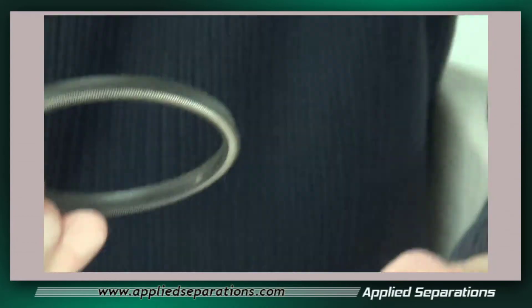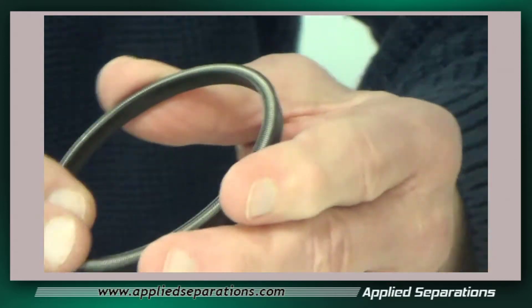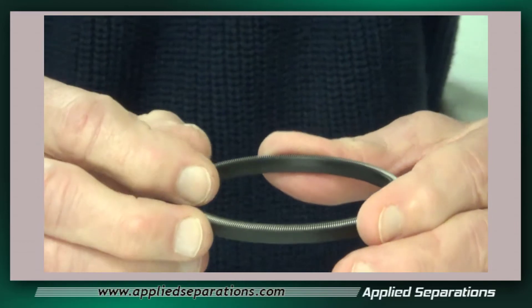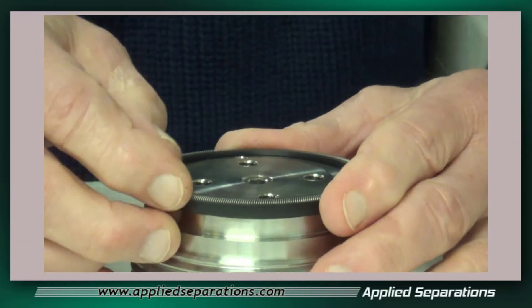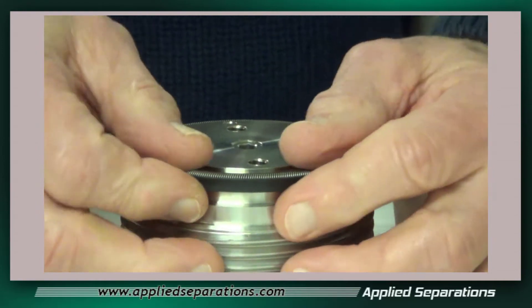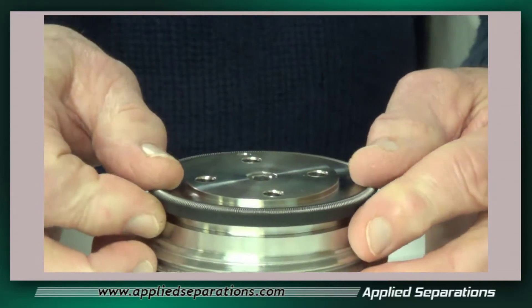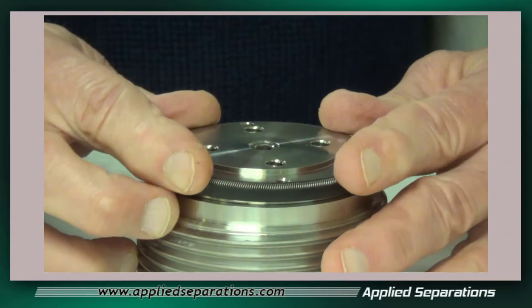We have a new cup seal here. As you probably already know, the open side of the cup seal should face the interior of the vessel — the pressure side of the vessel. So we just gently push this on here, making sure each side is pressed down a little at a time so you don't put any marks into the cup seal.